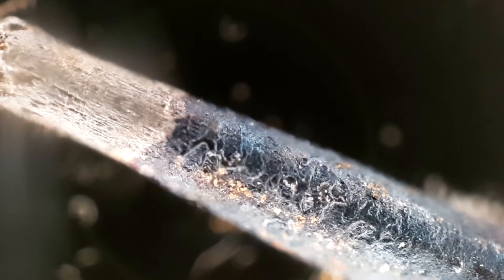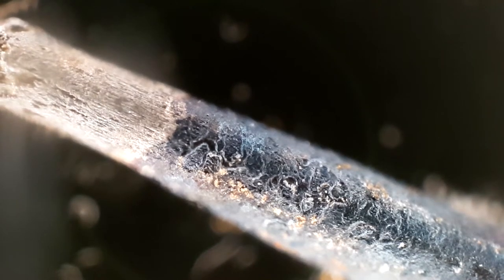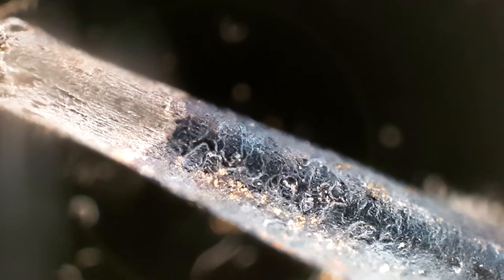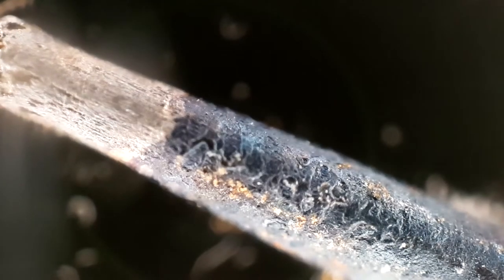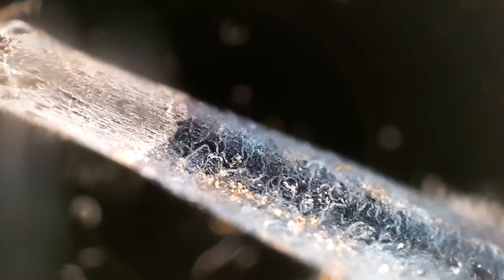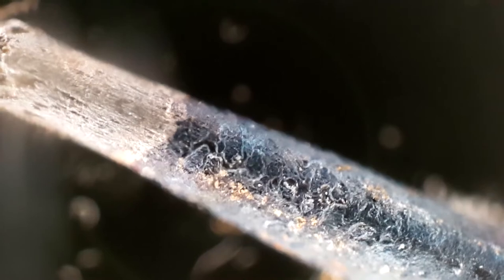A little bit further down now. Again, see that clear demarcation. And it goes into a very different kind of pattern rather than the long striations in the same aspect as the tip and the sort of rod, rather. There are these kind of like wavy bits. Let's have a look at this closer.